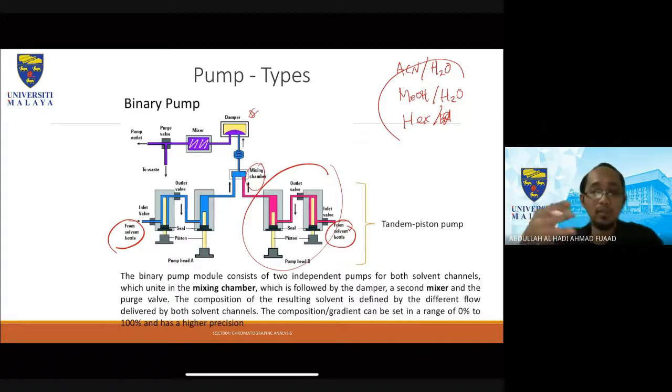J14 is a peptide that I used way back when I was doing my PhD, so my supervisor might still use it. If I were to use the same system to synthesize or purify the same peptide, J14, here in Malaysia, what I might want to do first is exactly copy the methodology being used by my supervisor.